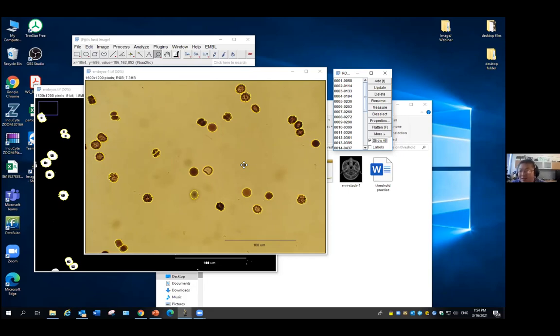What kind of standard you have is your choice. But just make sure your goal is to make a protocol. You will stick with this protocol and apply it to all the images. And the good thing is the results are more reliable and consistent. Once you have a protocol precisely set, you can convert this protocol into a code. Then you can do that in a batch.